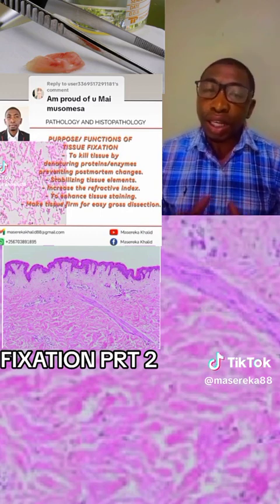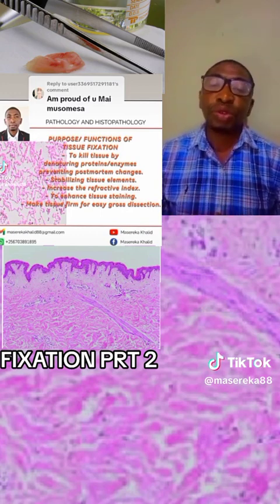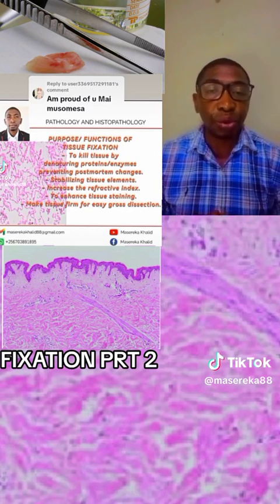So those are among the few reasons why tissue is fixed.